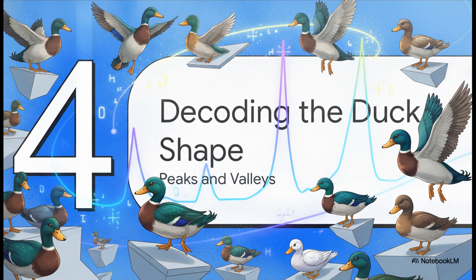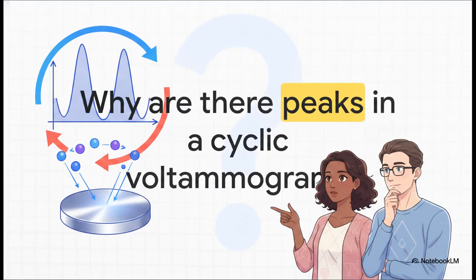Time to make sense of these rather unusual peaks and valleys. When you look at a classic cyclic voltammogram, it quite literally looks like the silhouette of a duck.